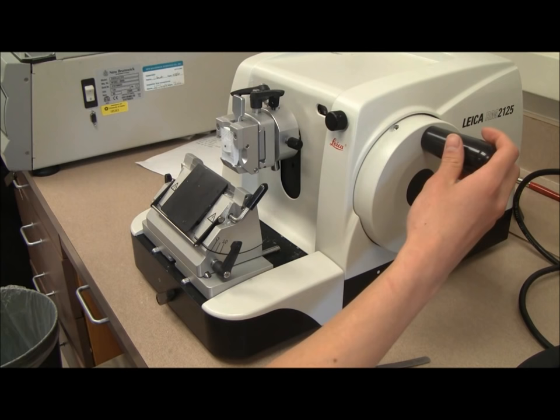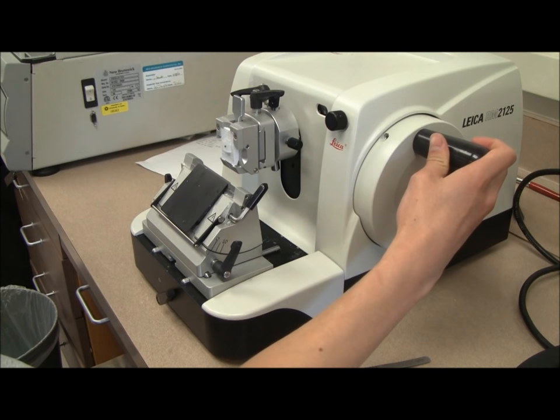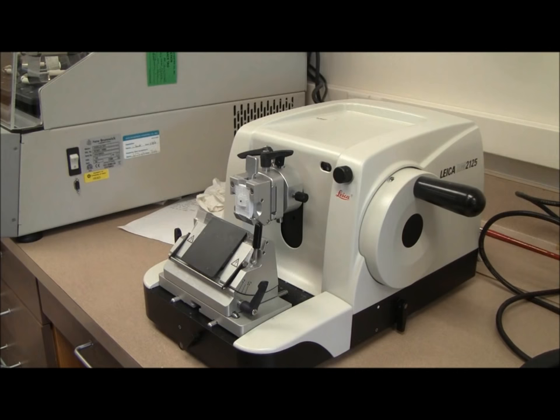The hand wheel on the right side is used to move your block downward across the blade. In order for the wheel to be turned, the safety knob must be turned downward and the handle pulled outward. Make sure to push the handle back in each time you finish using the microtome.